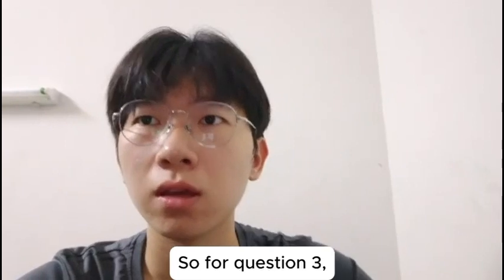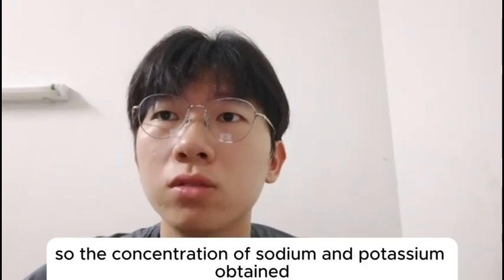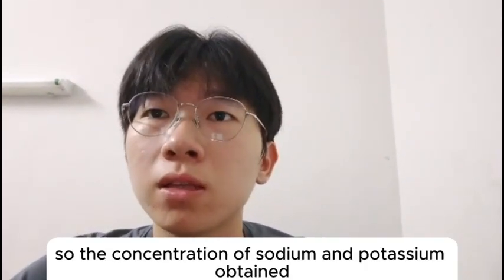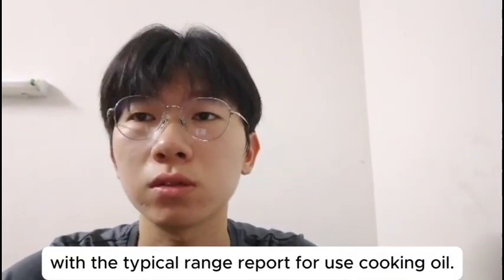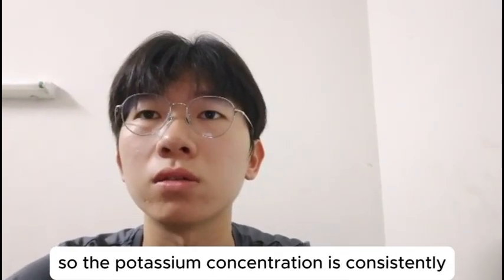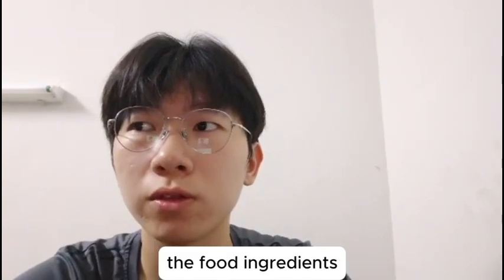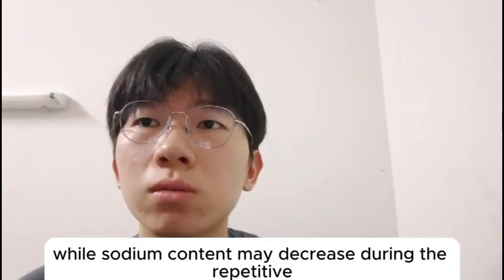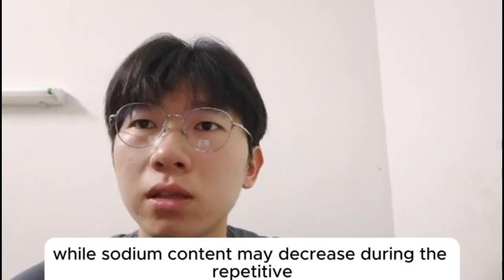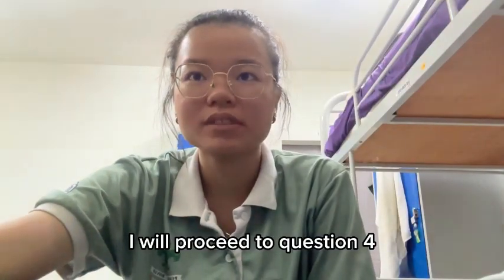So for question 3, comparison with literature or regulatory limits. The concentrations of sodium and potassium obtained are relatively low compared with the typical range reported for used cooking oil. The potassium concentration is consistently higher than the sodium, which agrees with the literature findings where the potassium originated from the food ingredients such as vegetables and seasoning salts, while sodium content may decrease during repeated frying and also oil degradation. I will proceed to question 4.